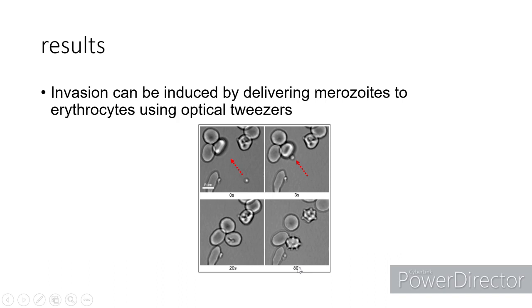This result proved that the merozoites are not killed by the optical tweezers, and the merozoites can still invade the erythrocytes successfully.